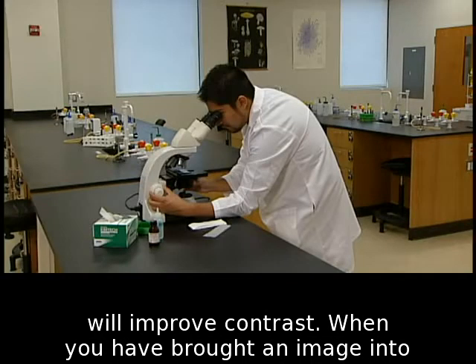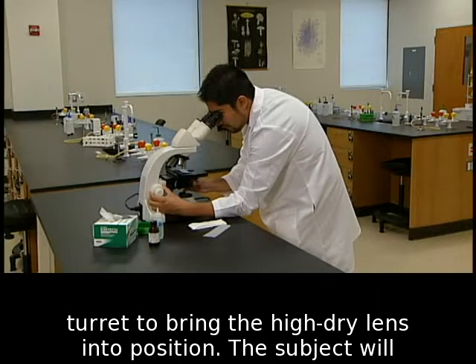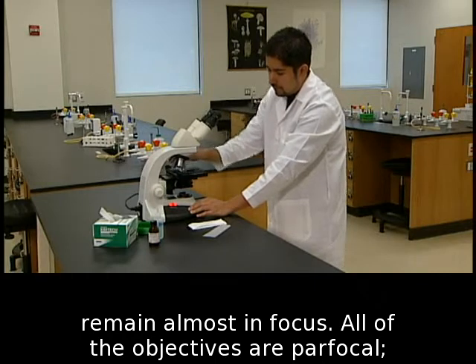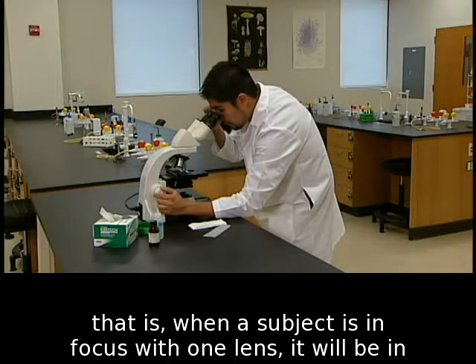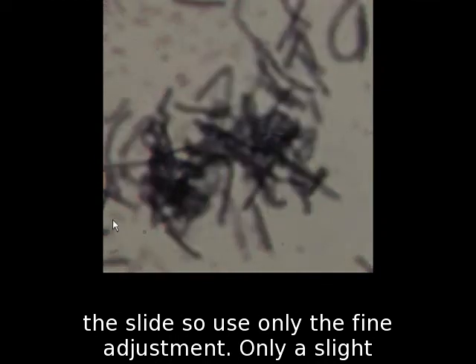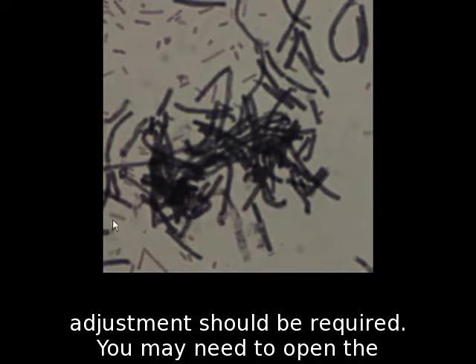When you have brought an image into focus with low power, do not move the stage. Rotate the turret to bring the high dry lens into position. The subject will remain almost in focus, as all of the objectives are parfocal — that is, when a subject is in focus with one lens, it will be in focus with both lenses. The high dry lens is close to the slide, so use only the fine adjustment. Only a slight adjustment should be required.